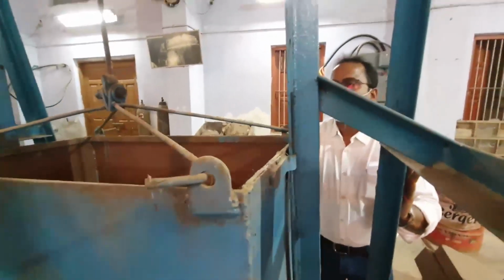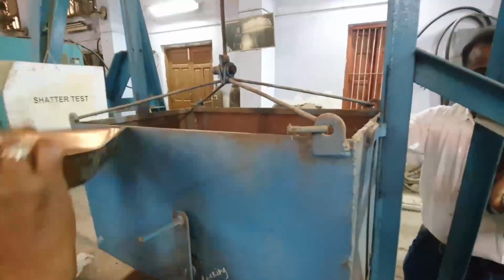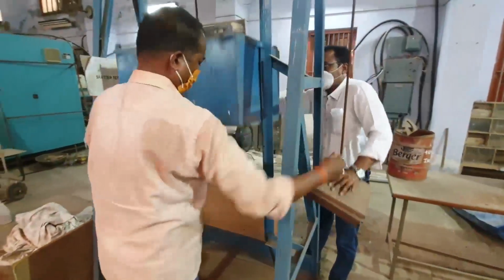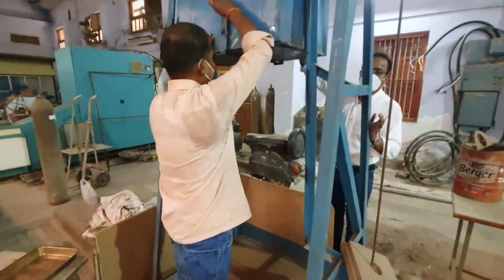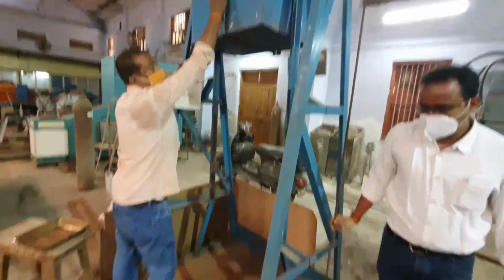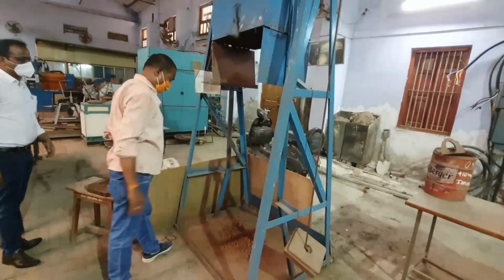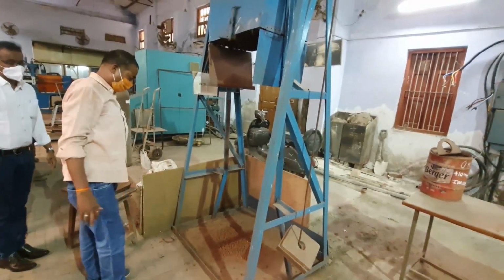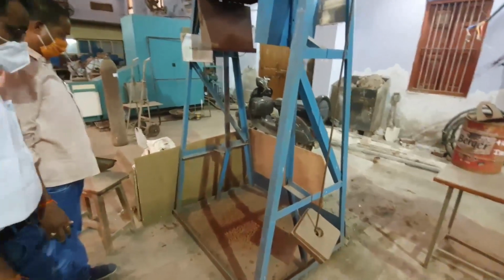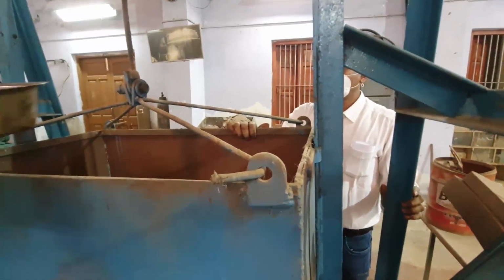Second time we are loading this iron ore, and open the door. Collecting material. Third time we are loading this iron ore.